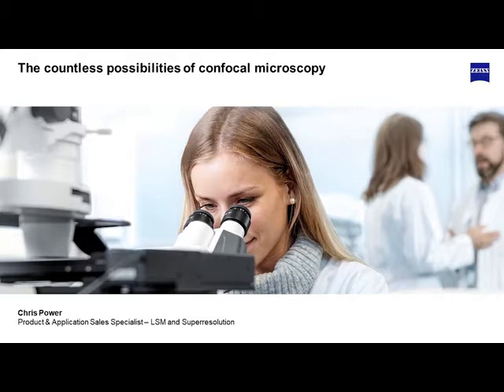I want to concentrate on the history of confocal, how these machines have become the workhorse in the field they are today, to go through how we've improved these systems over time, and then to paint out some of the vision we have at Zeiss of where these systems are going and how they can continue to be the workhorses in labs in the future.